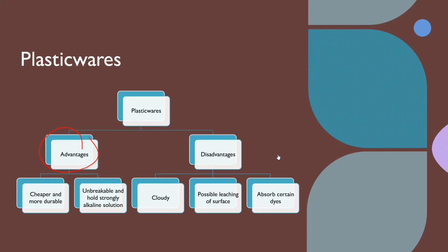I just would like to share this experience of mine during a face-to-face class, wherein one of my students used a disposable pipette for hydrochloric acid, and this particular student approached me saying, "Sir, the dropper melted." I asked that student, where did you put it? In hydrochloric acid. And I replied with a great smile and said, "Wow, amazing."